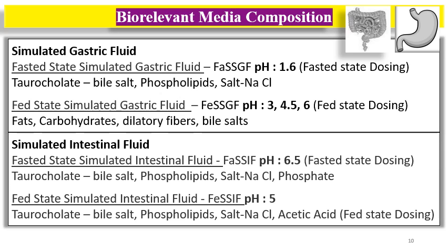Then what is the composition of this media? In QC release media, the buffers are used. Here some different composition is taken to mimic the GI conditions.